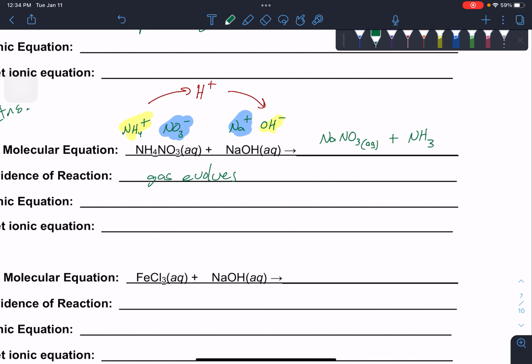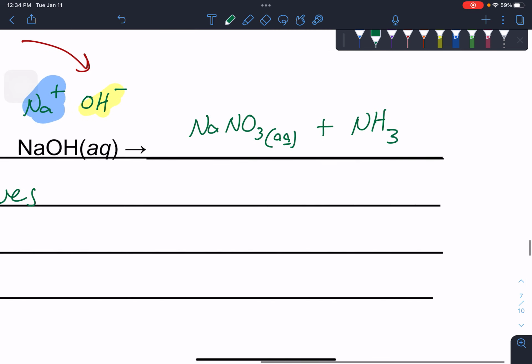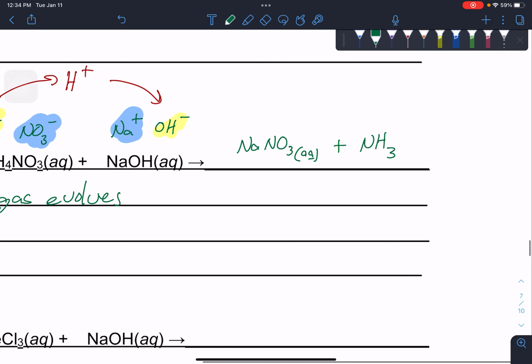And this is one reason, again, the ammonia has a distinct smell, but it doesn't really bubble all that much, which is probably good, because if you're dealing with a solution where ammonia is bubbling off, you're probably not in this class. Ammonia gas is something you have to be careful with.